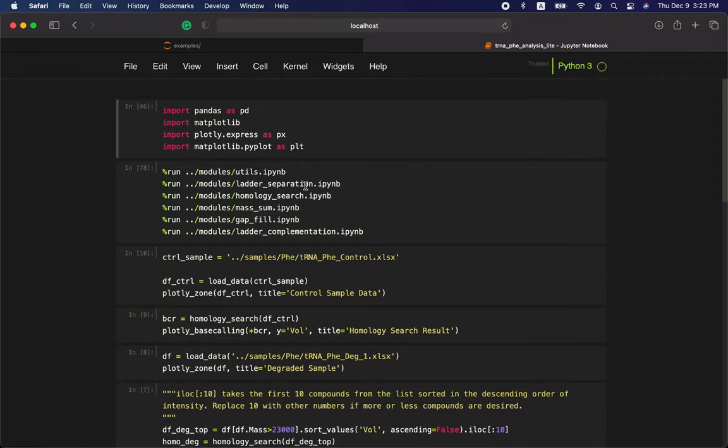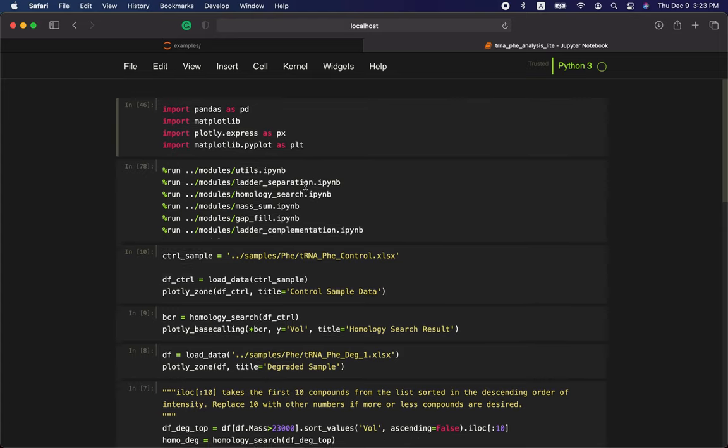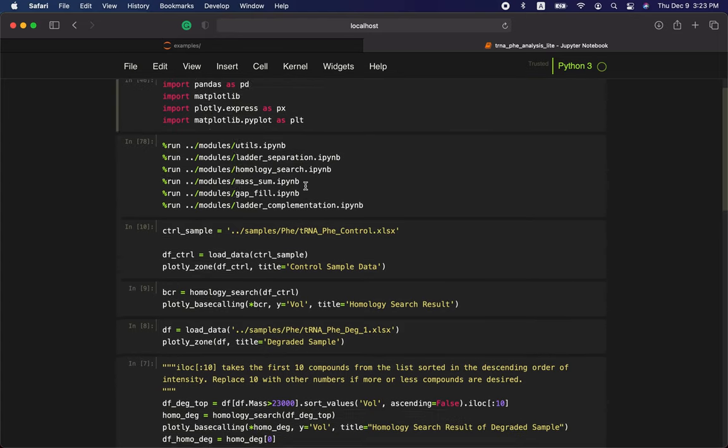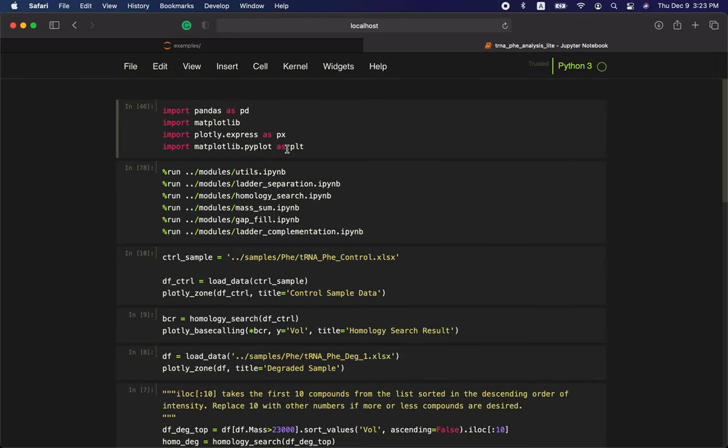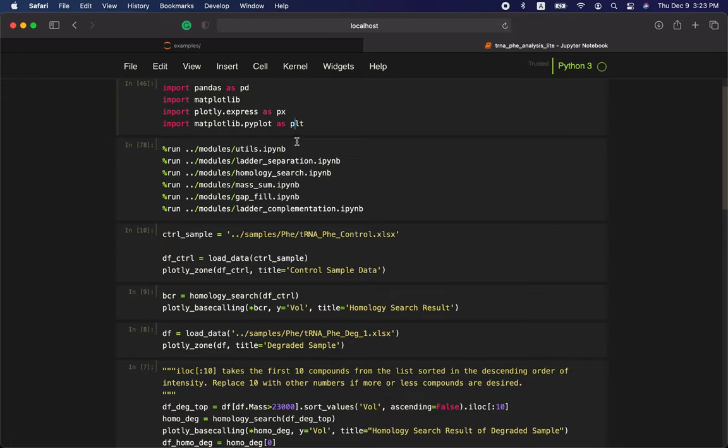It's very short and we can get the result in one minute. In the beginning we import several libraries and then load the mlc-seq algorithms.